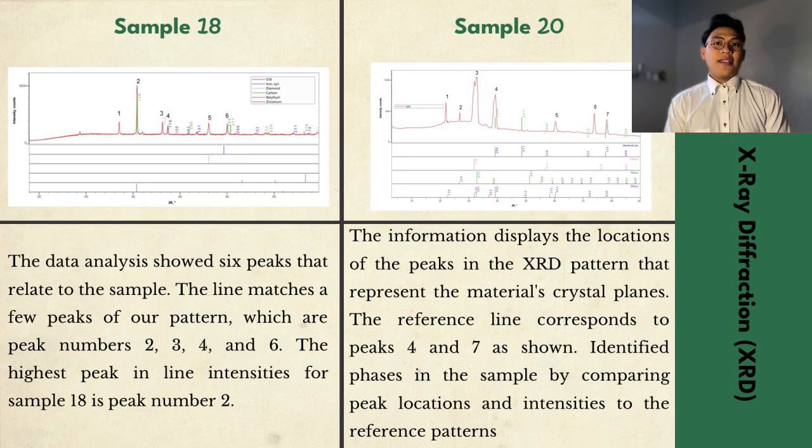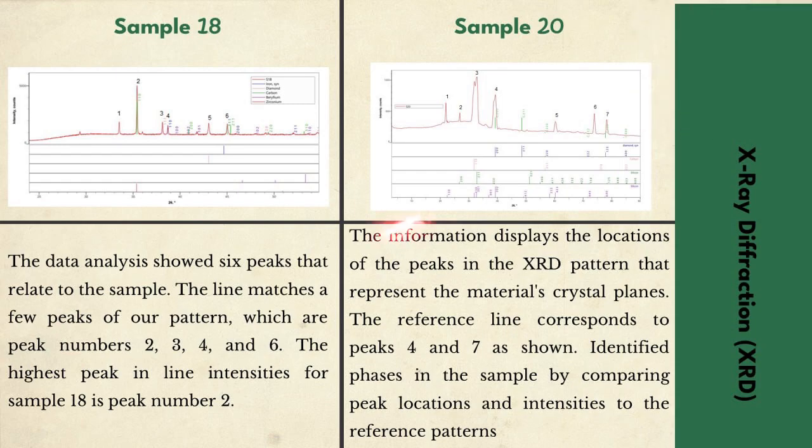We can verify the presence of the identified phase in the sample by comparing peak location and intensity to the reference pattern. A good match suggests that this sample contains the identified phase.